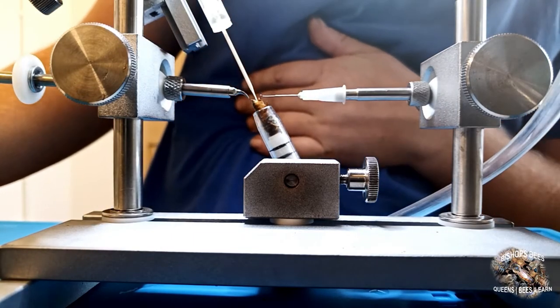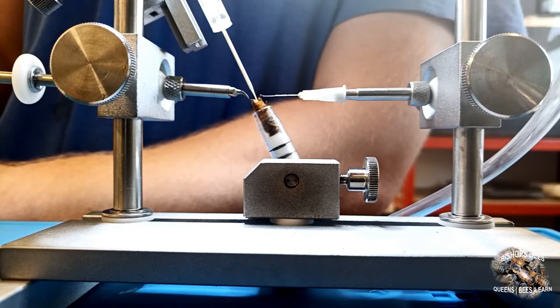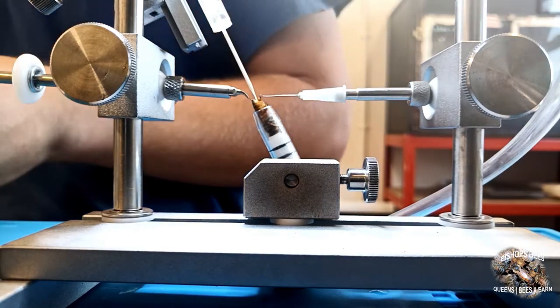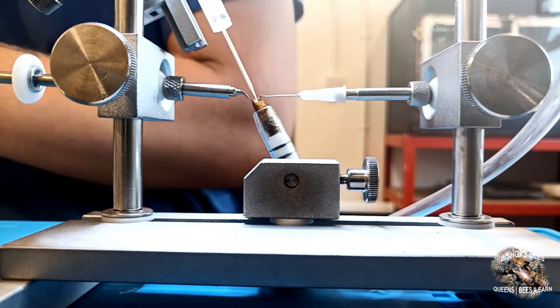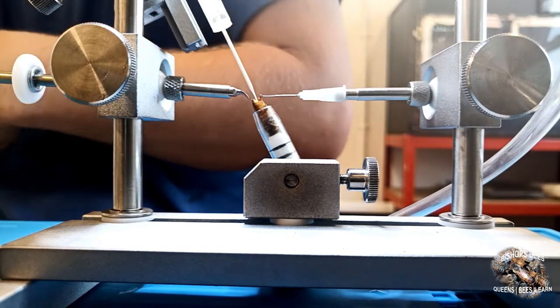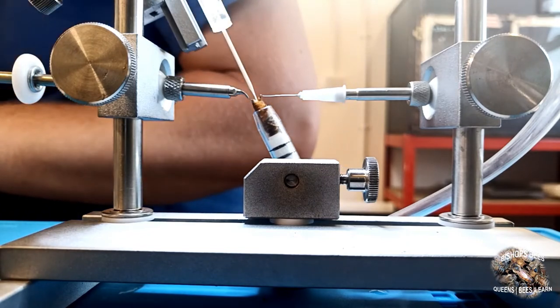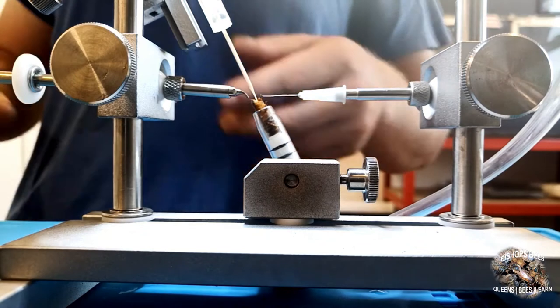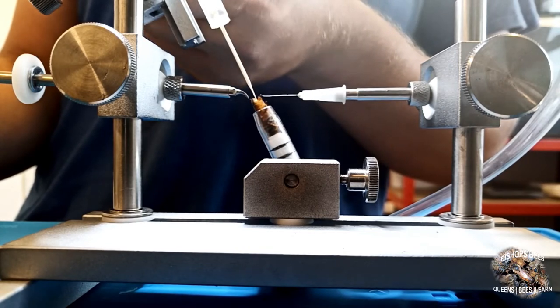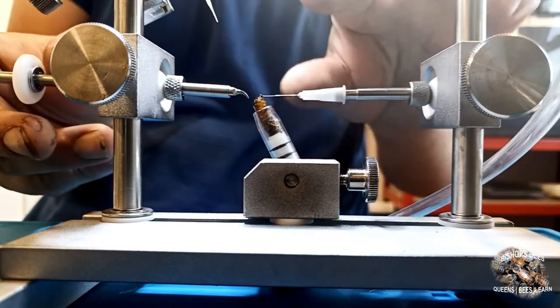Semen is then injected into the queen, between 5 and 8 µL. It is important to watch for leakage around the insemination tip to make sure that the tip is well-positioned. Once the dose of semen has been injected, the insemination tip is drawn back clear of the queen. The queen is then released, first releasing pressure on the sting from the sting forceps and then removing the ventral hook.